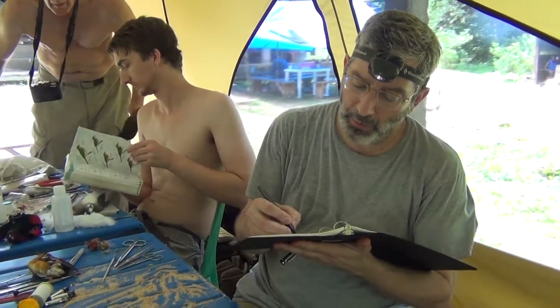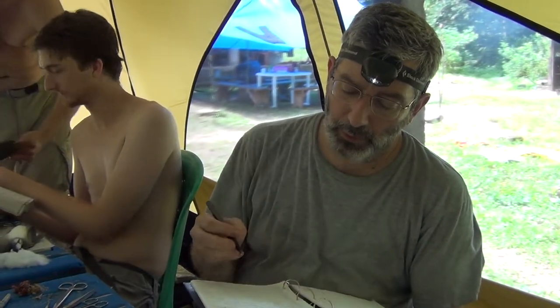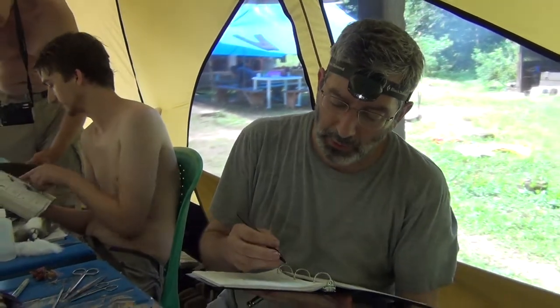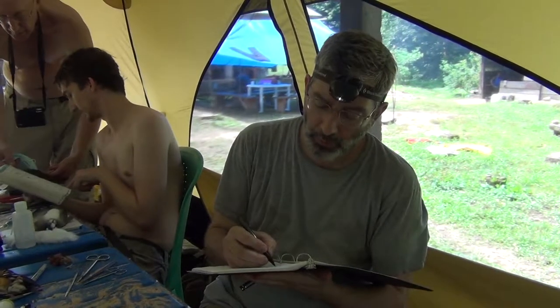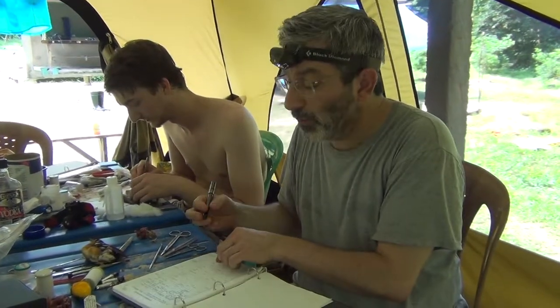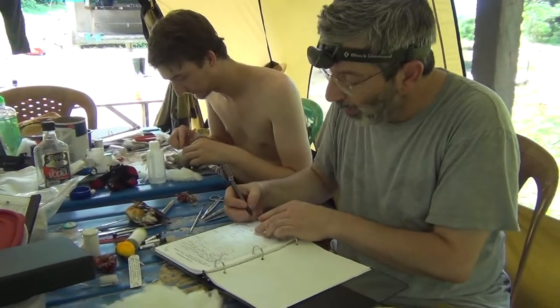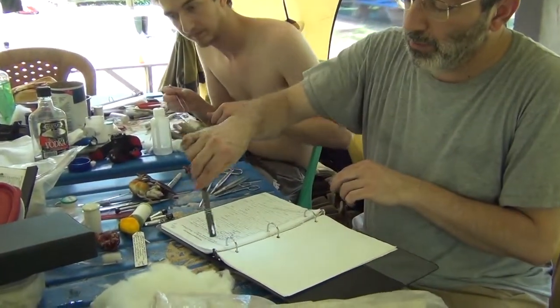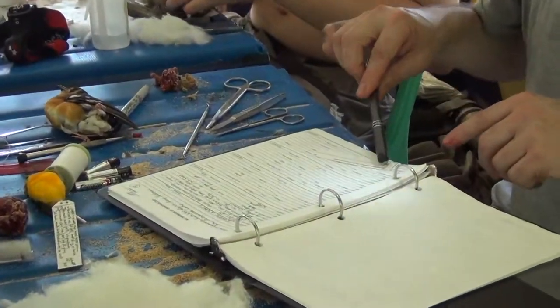Before I forget any of this, I've got to note down all of the data on the bird, including its gonadal condition and stomach contents. The data are now complete, so I'm going to write out a tag. The important thing to note is that all of the data that are on the catalog page are also on the tag.